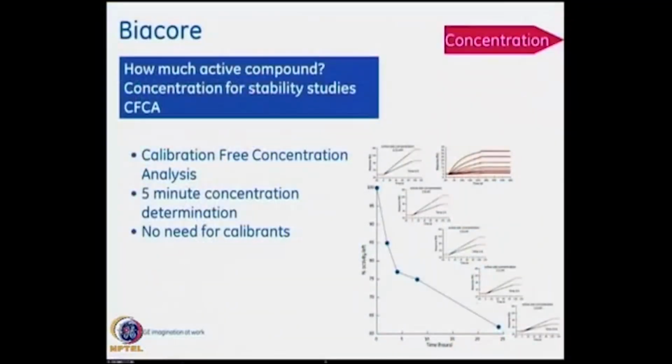Thank you. Going on to the next application, I always think that concentration is very less studied, but it's very important, because if you look at concentration analysis across the world for proteins, there is no way that someone can measure active protein concentration without having calibrants in their hands. Whenever you give a student a protein and say, please measure the concentration, the first thing that he will ask you for is calibrants, standards. And the problem with these standards is that sometimes they are not available. Sometimes they are extremely expensive, and being proteins, sometimes they degrade. They're not stable.